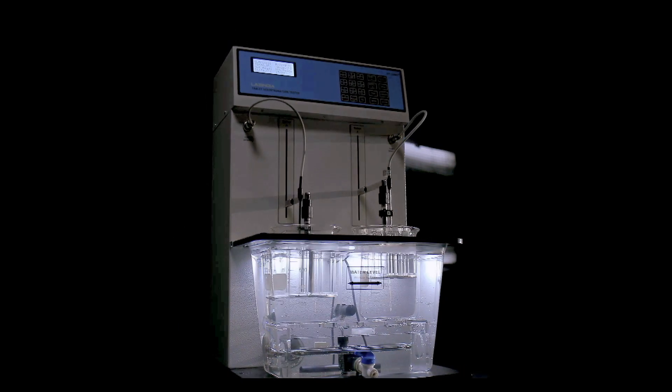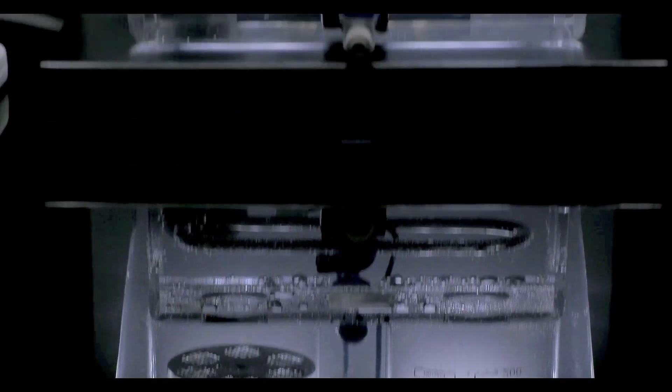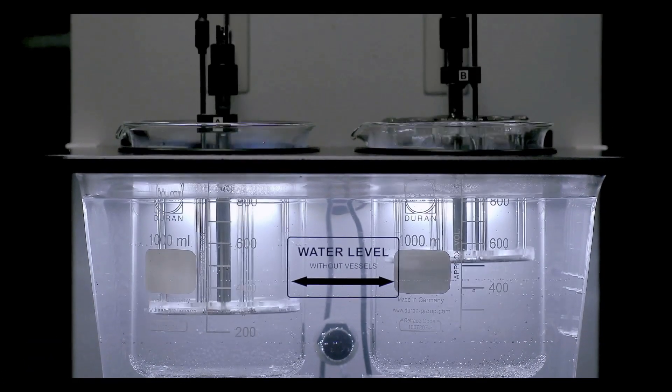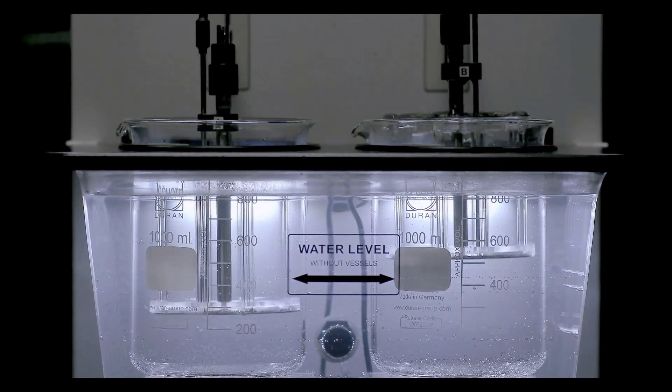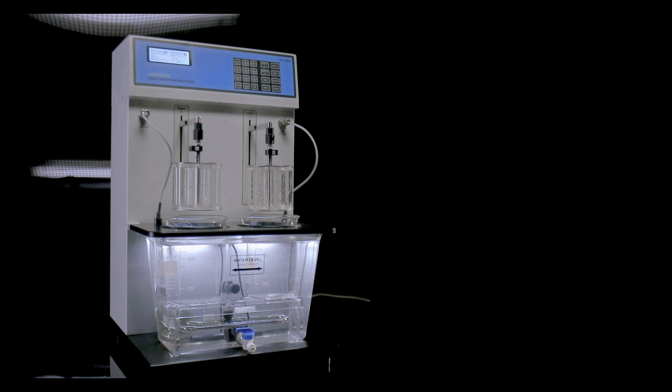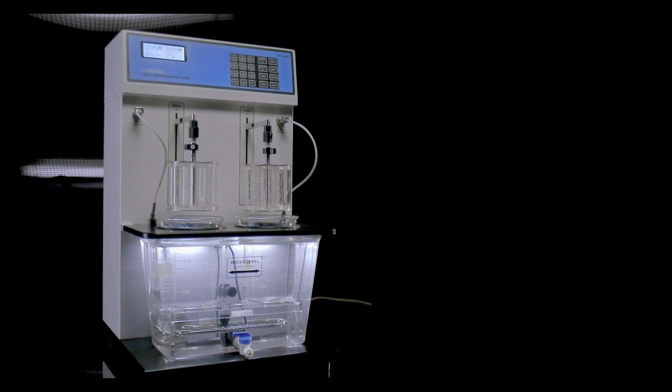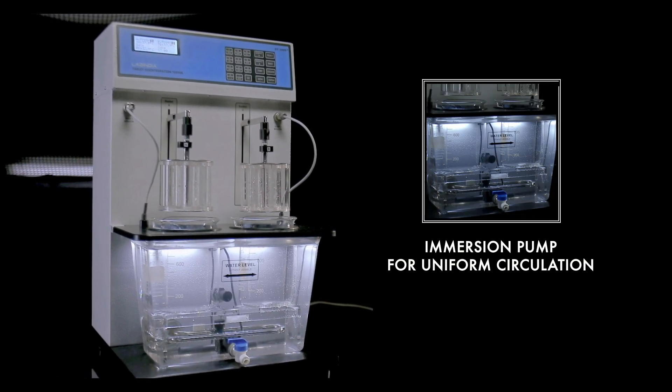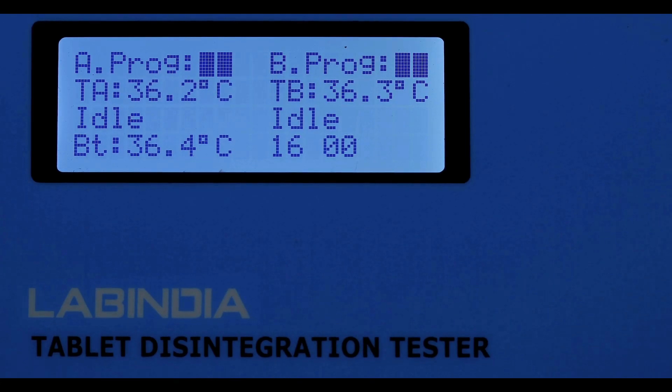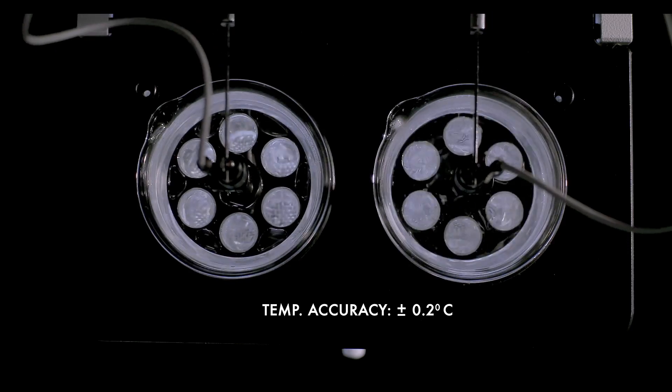It is accurate in determining whether the tablets disintegrated in the prescribed time. The molded clear acrylic tank with illumination gives better visibility, and the imported immersion pump controls heat circulation. External temperature sensors for individual beakers make temperature validation easy.